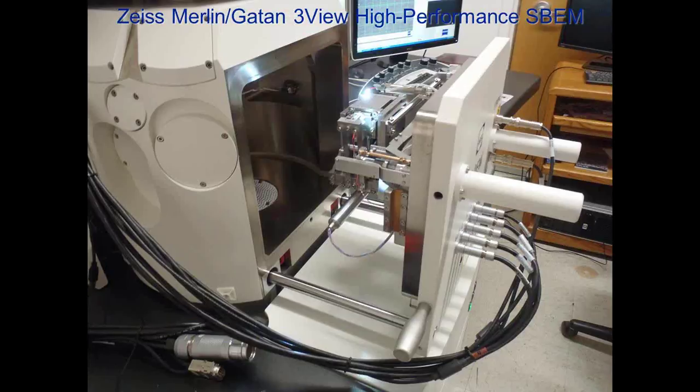The 3View system itself is flawlessly integrated into the Merlin. We can see the new door and the stage containing the miniature robotic ultramicrotome here, the light. The ultramicrotome really is a fine piece of engineering design, if I may say so myself. And from the very start, the images were very impressive.